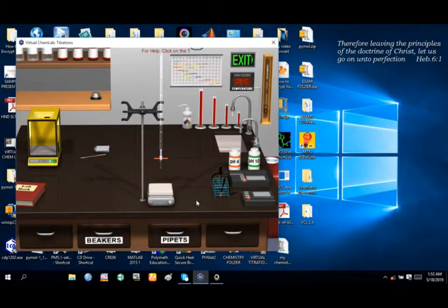In this video, we are going to watch an acid-base titration, and the type of acid-base titration is that of a weak acid versus a strong base. This titration may be of help to you as a chemist or as a student of chemistry or a similar audience. Those that are interested in chemistry can also make use of this video.